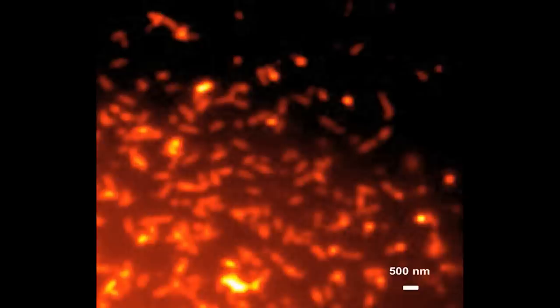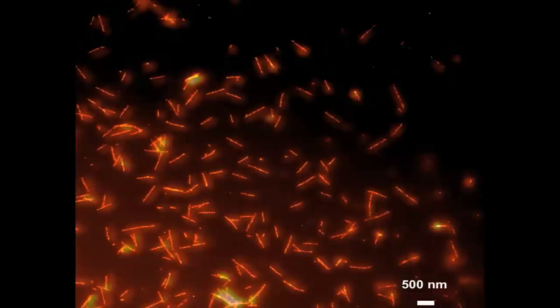But with super-resolution now, we are able to see exactly how this process of aggregation, how these molecules grow in size and how they cause toxic effects. Effects that cause cells, brain cells to die. We can see this directly now for the first time.